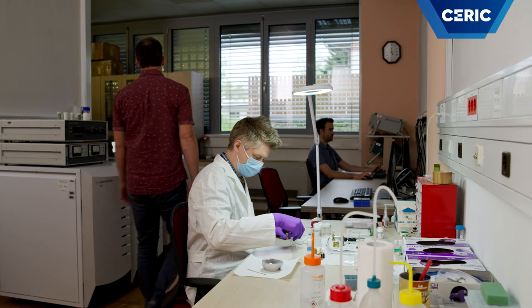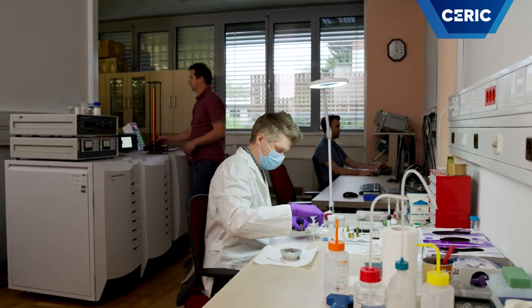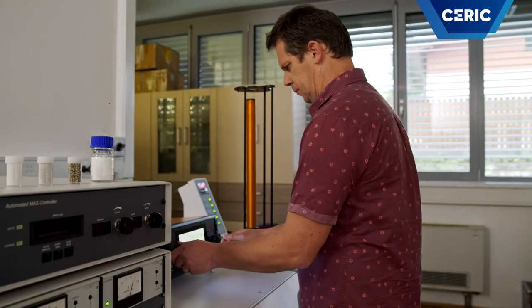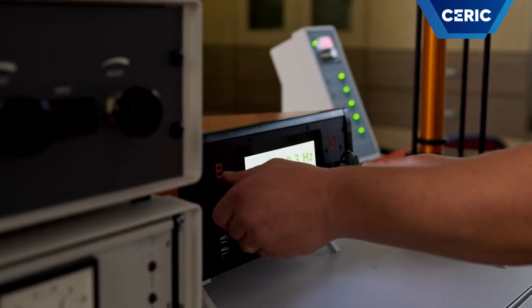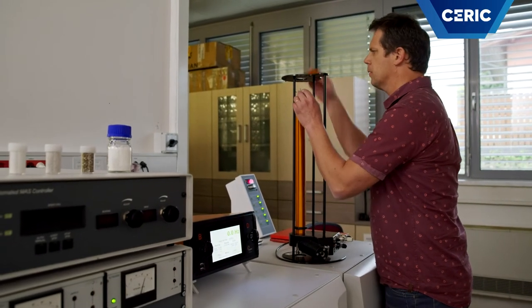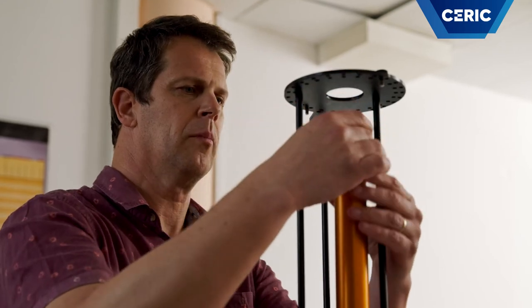Okay, this is the lab where my colleagues and I do the majority of the experimental work. This is where we do solid-state NMR. Solid-state nuclear magnetic resonance is one of the most powerful spectroscopic techniques because it can provide element-specific atomic resolution insight into solids. It exploits atomic nuclei with magnetic dipole and electric quadrupole moments as tiny probes for the detection of the local magnetic and electric fields. Through the detection of these fields, solid-state NMR offers insight into the local structure, processes, and dynamics in solids.